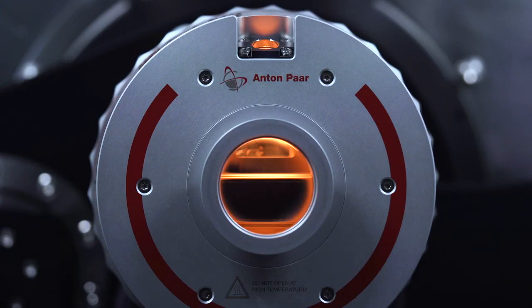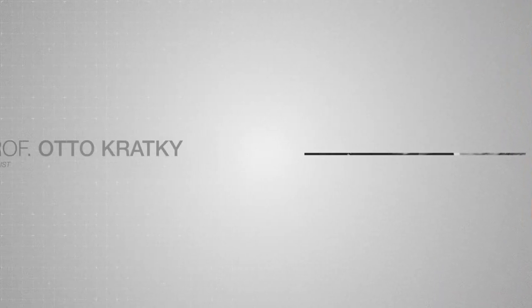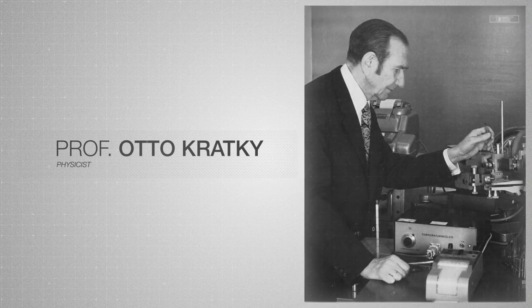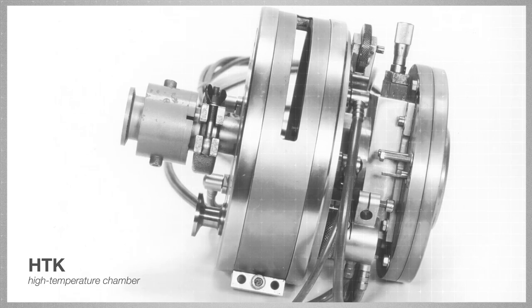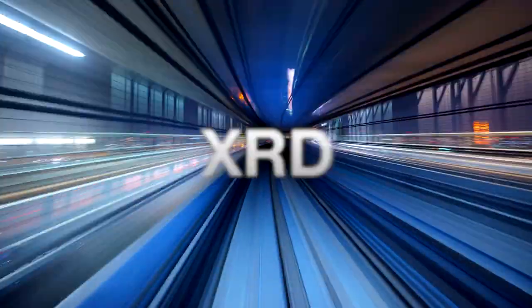When something is in your DNA, it drives ambition. So we've taken on a new challenge, expanded our playground. We set the tone in small angle x-ray scattering and non-ambient diffraction for more than half a century. Now we're driving XRD.